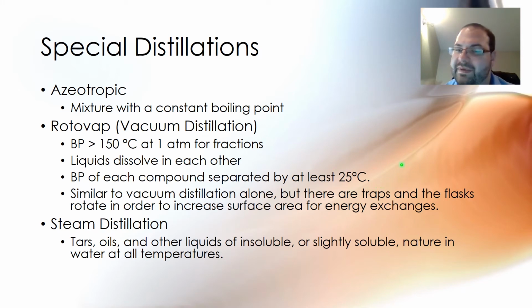And all of those create different temperature ranges that you can lower the temperature to. Some of them get maybe 20 degrees below zero. Some go 78 degrees below zero. Some go in between those, and sometimes it's 5 degrees Celsius. It just depends on what you're using. And you have to cater to the particular thing you're doing.